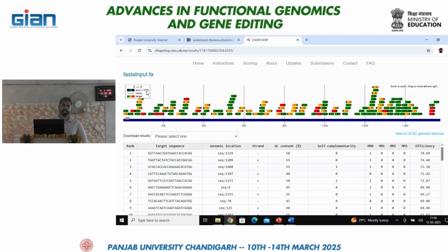But as we have taken the CDS itself in the first place, the color coding sometimes will not match accordingly. In this tool we can use the normal genomic sequence as well, but in some tools there is a limitation that we have to use the CDS part. That's why I told you to take CDS consistently throughout. So I don't think the color coding will be a problem.